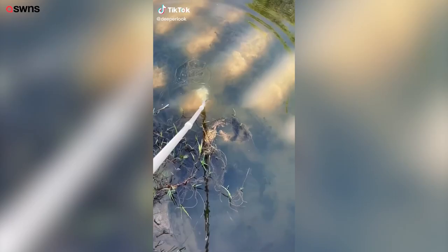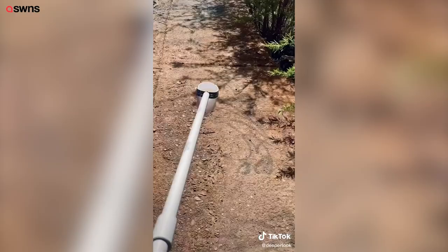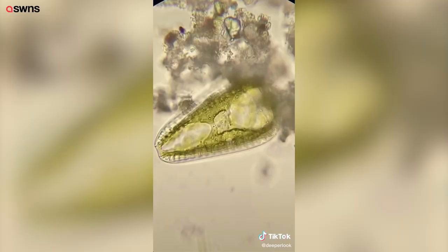I put a cup on a really long stick so I could look at the microbes on the bottom of this creek. Since it's sunny and warm and the water is clear, I knew I would find diatoms.